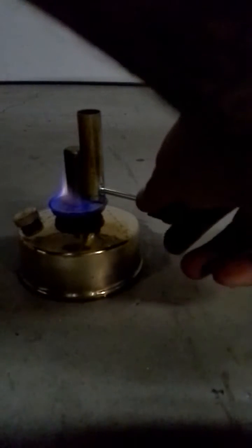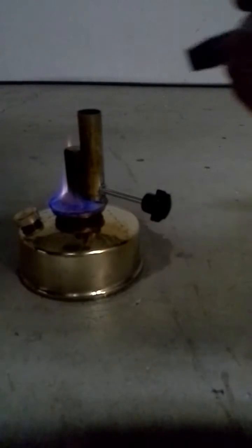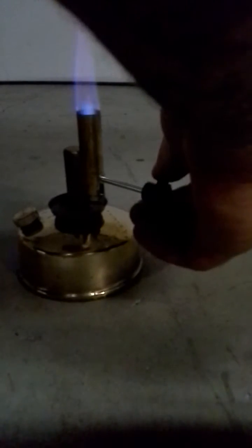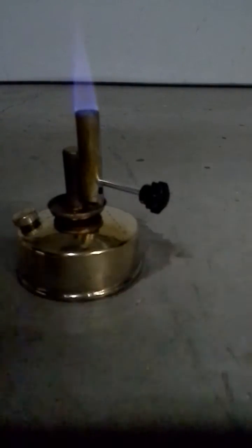Make sure this is all the way down — this slide. Just to show you what I'm talking about. There we go. And then this to adjust it. You got the tip, needle point almost, and then wide open as it can be.